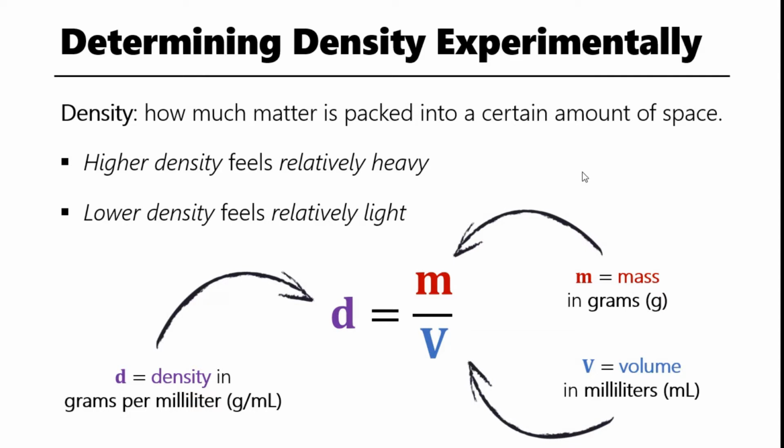We're going to measure the mass, which is something that we're pretty familiar with. We're going to measure volume, which is something we've also done before, but in this case, we've got to put a spin on it. We've got to get a little creative with how we measure the volume.